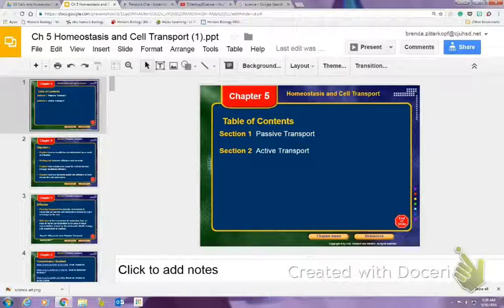All right, so by now you guys have all massed your either eggs or carrots after they've been soaking in that solution for that 24-hour period, and you obviously should have seen some changes in masses, right? And some may be very dramatic changes. So a lot of you are saying something's gone wrong, or, well, maybe not. Maybe your data is what your data is, and you can't say that it's right or wrong. Something happened, and now you have to observe what you think happened, okay?